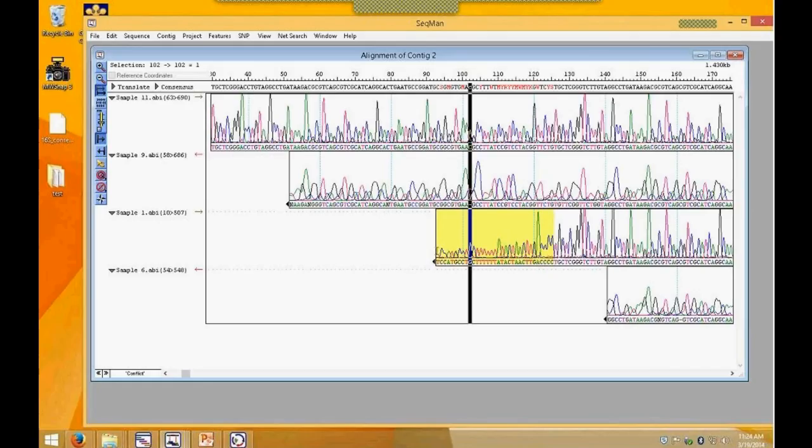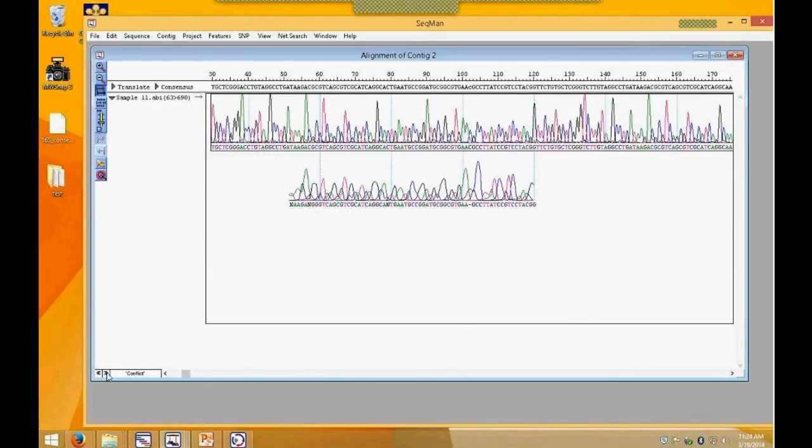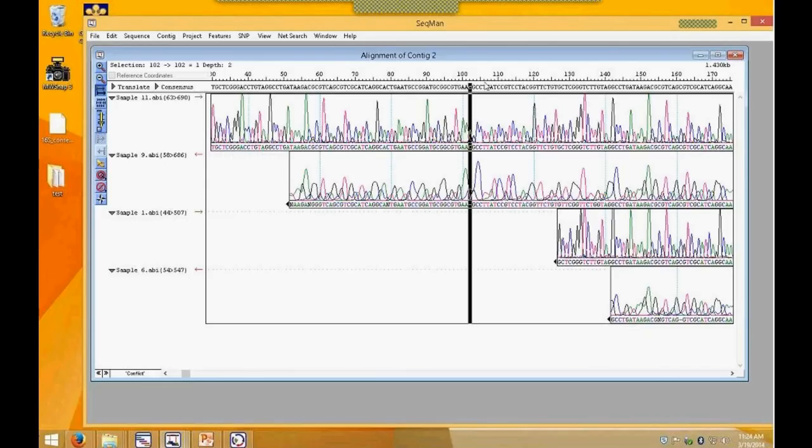All this mismatch, that's probably vector. In some cases, though, it's just low quality sequence. See what happens here. See there, now we're getting a bunch of ends there. But sometimes even a crummy sequence like that, you can get just a little bit more data to confirm your consensus. And that one doesn't work there. Let's look for another one. And you can see that's the only conflict in the consensus.